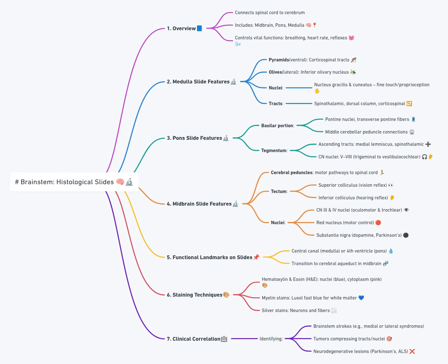Slide 4, Mid-pons, fourth ventricle floor. The ventricular cavity is prominent. On each side of midline identify the motor and principal sensory trigeminal nuclei, large, lightly stained regions. The medial lemniscus has rotated dorsomedially. The superior cerebellar peduncle lies posterolaterally, its decussation visible in higher sections.